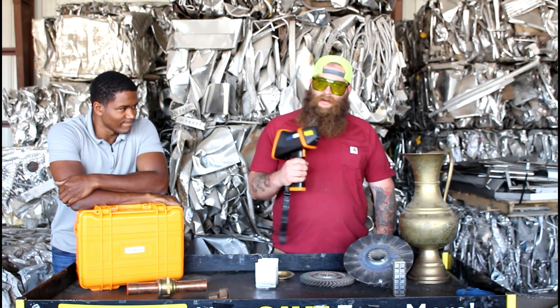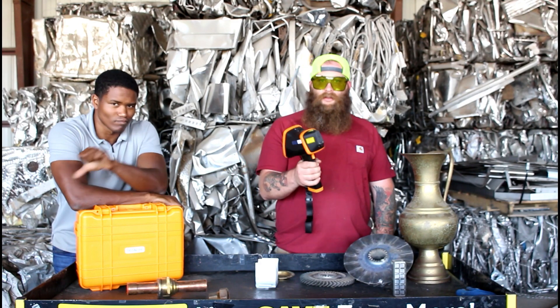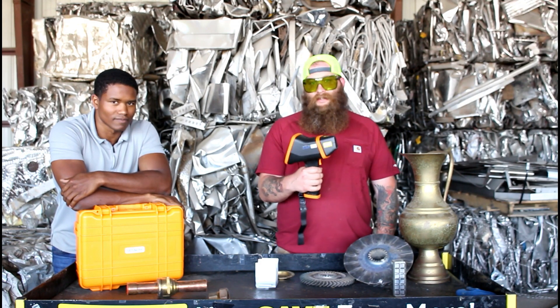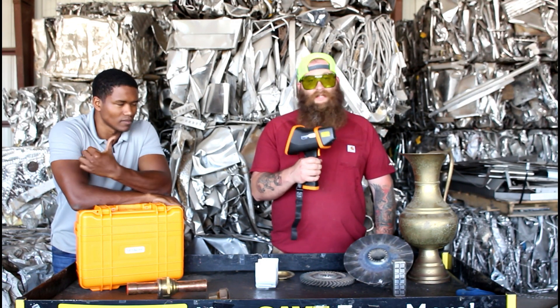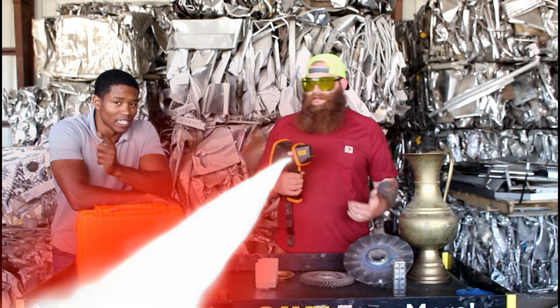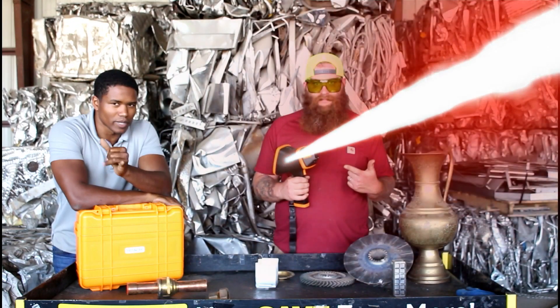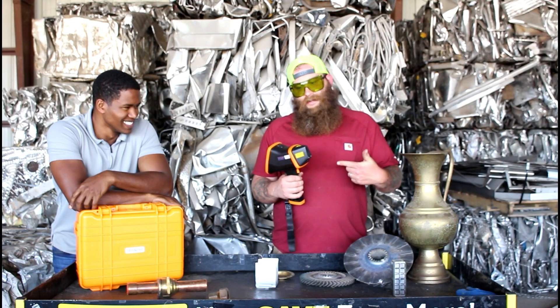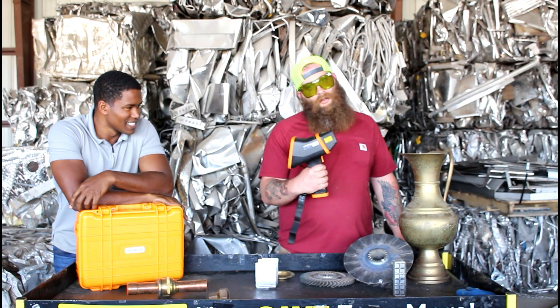It's different than the regular Niton guns that most of you are used to seeing, because Niton guns use x-ray technology and this uses LIBS technology — Laser Induced Breakdown Spectroscopy. I can't say that, which is why Vidal's here. So we're gonna show you how it works.